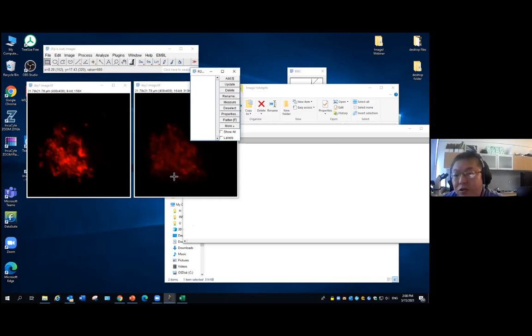So today we're going to cover the simple things, and tomorrow we'll mostly try to create a mask binary image, and then use the Analyze Particles function to generate the selections automatically.